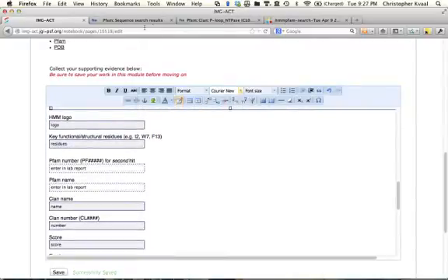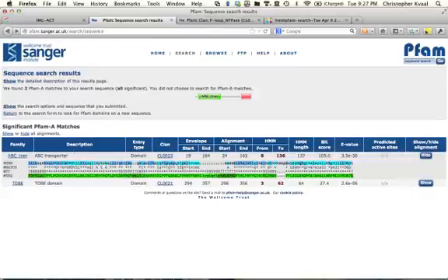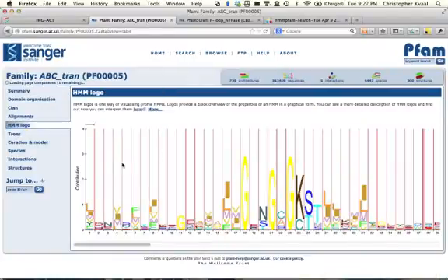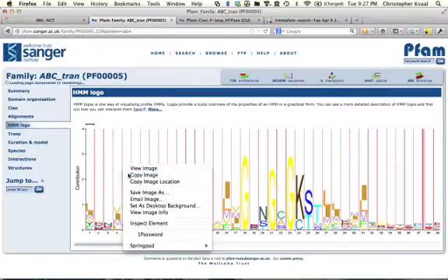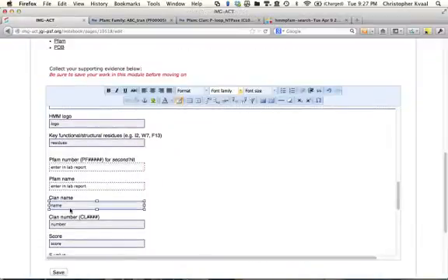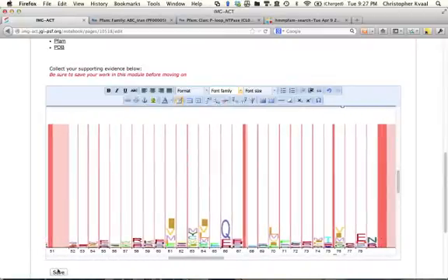Now for the HMM logo and key functional residues. Getting back over to the family, I can click right here and see the HMM logo. We copy this image and paste the image right in there. Looks beautiful.